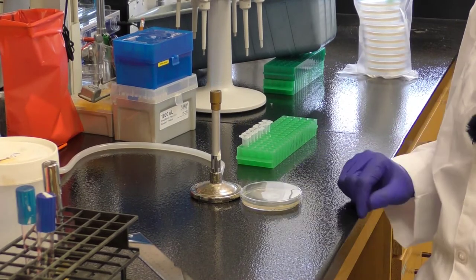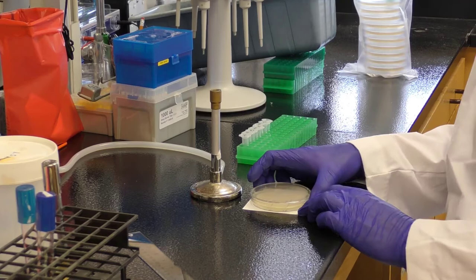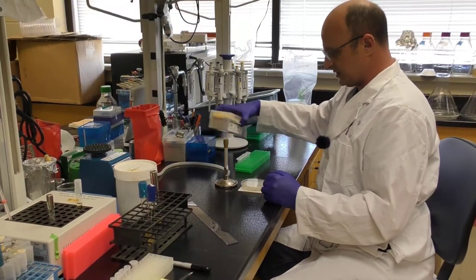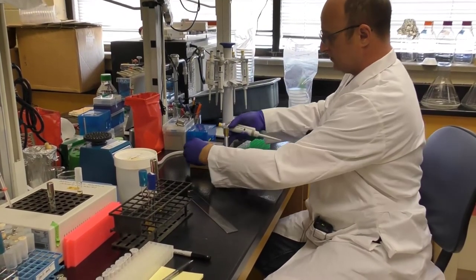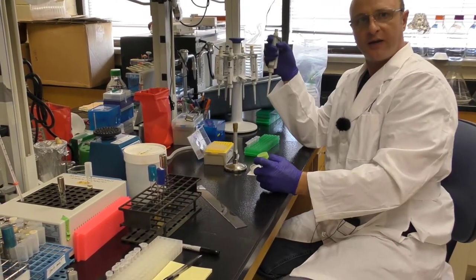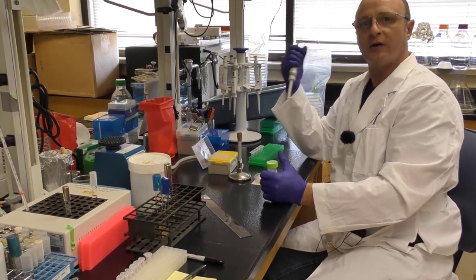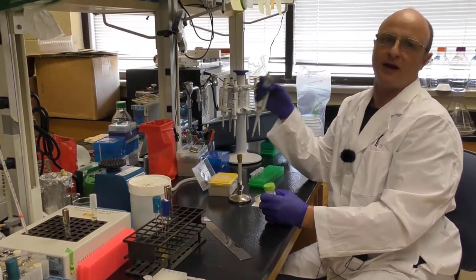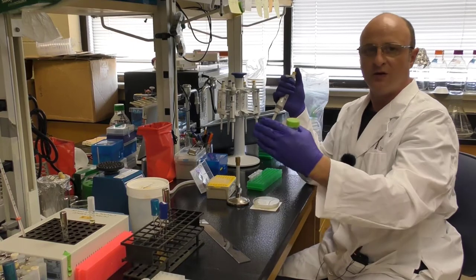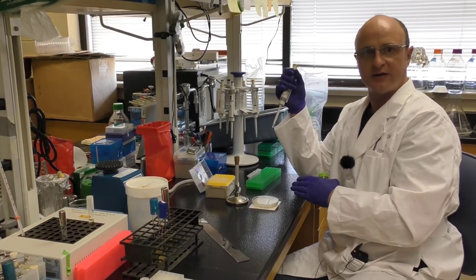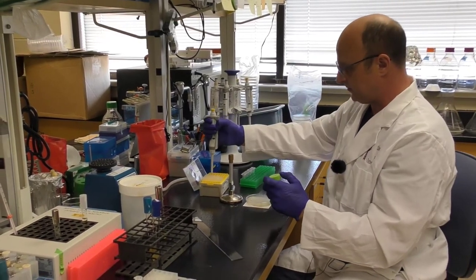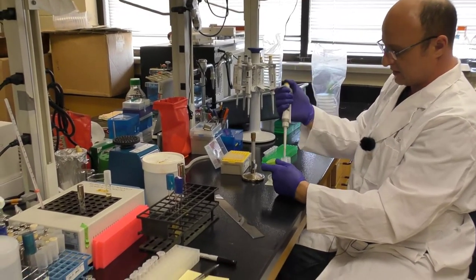So our lawn is set and ready to go. It might be a good idea sometimes to place something white underneath just so you can see your spots as you place them onto the lawn. In this case I'm going to do ten microliter spots. And we work in the reverse order that we create the serial dilutions. The first spot that we will lay down will be our control spot with no phages. Then we will do our minus eight and so on through to our minus one. The reason that we do that is there's more chance of taking contamination from the high concentration into a lower concentration. But if you take contamination from a lower to a higher concentration, it's unlikely to make a statistical difference to your results.